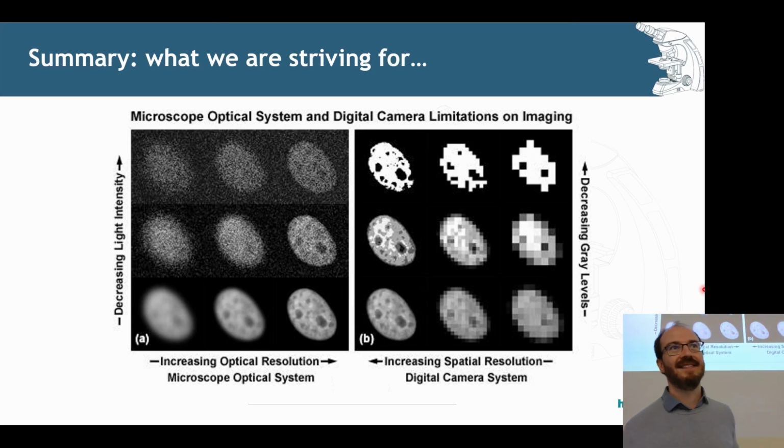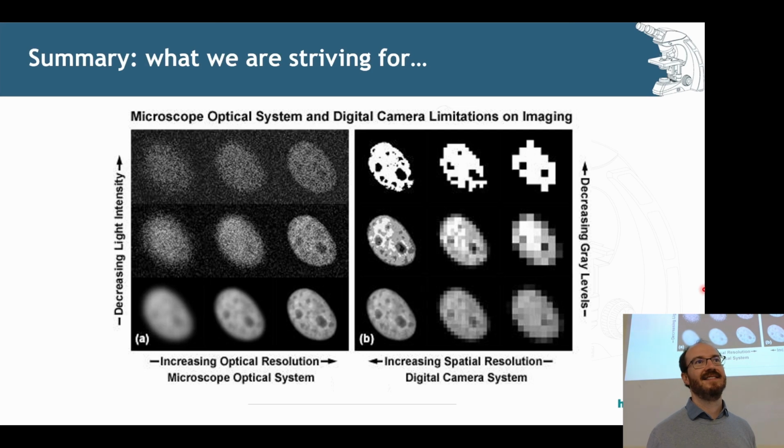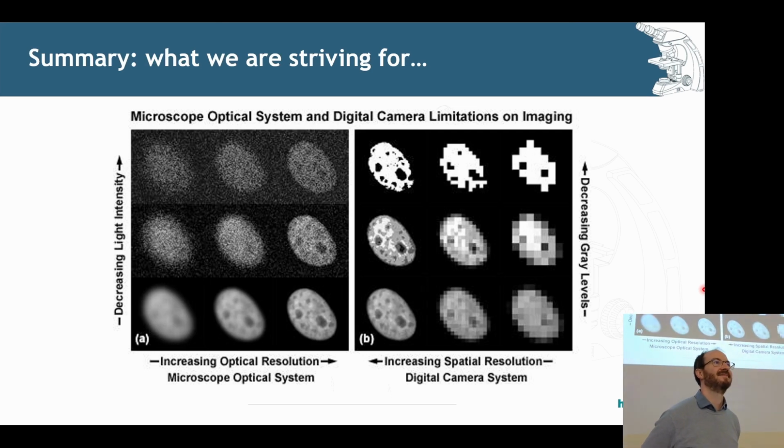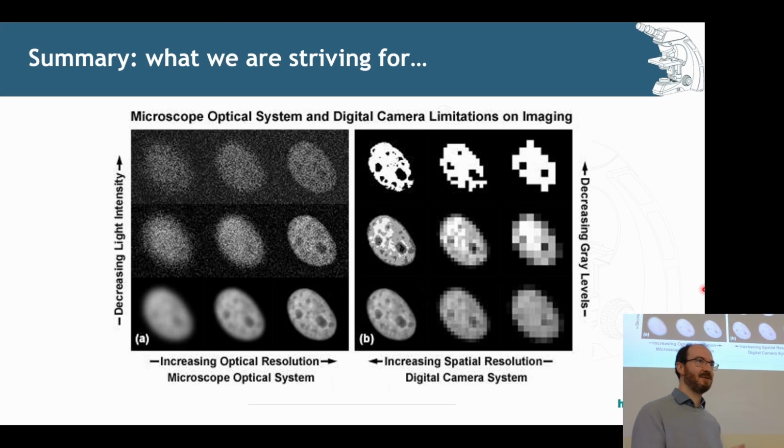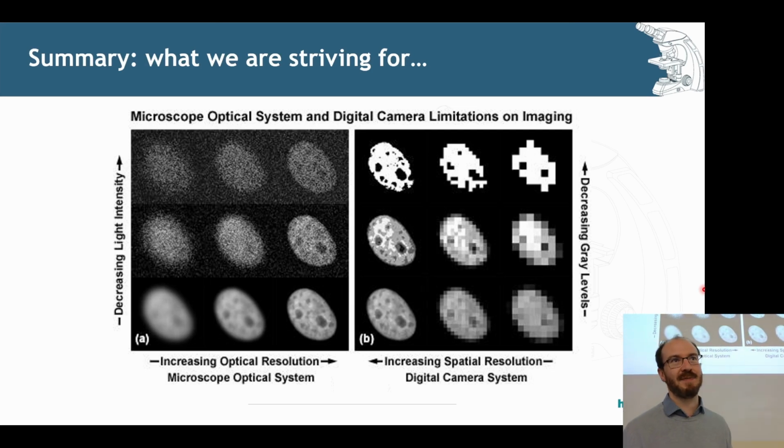Yeah, as a standard we keep to 8-bit in control, but I didn't realize the end result. Yeah. So maybe just a general suggestion, 12-bit, it's not that much larger, but it makes a massive difference. So from 8-bit to 12-bit, you go from about 250 levels to over 4,000 levels of intensity variation. So that's a very big difference for a low expense in size.